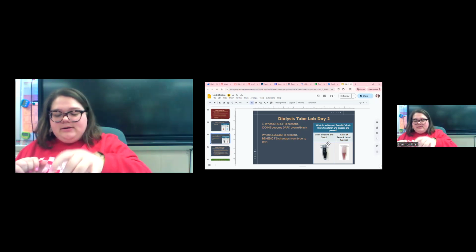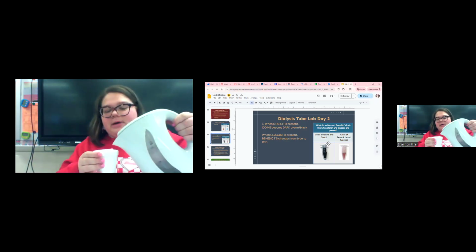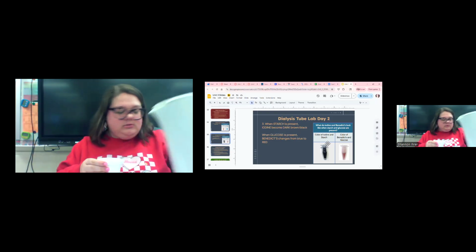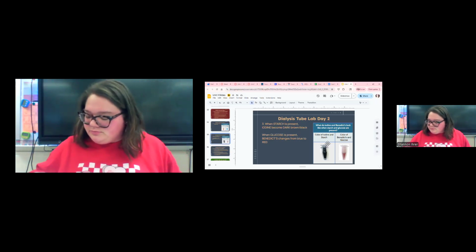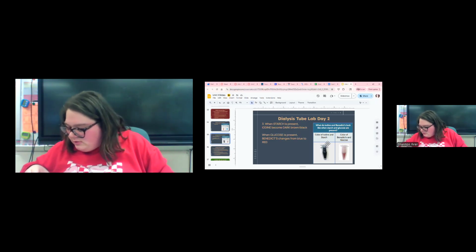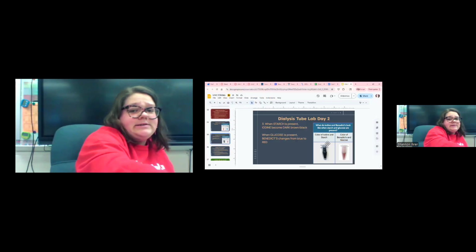Okay, we'll seal these and pour some hot water over them. We're giving some time for these to settle.